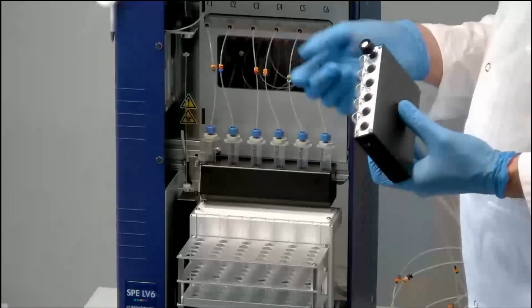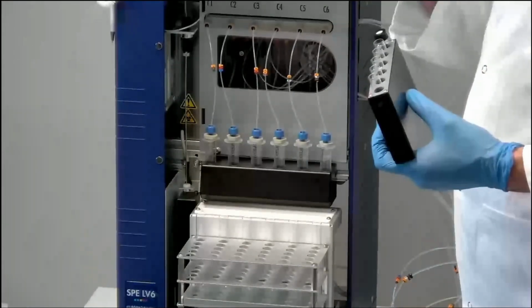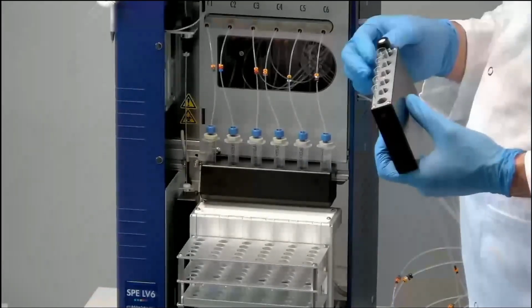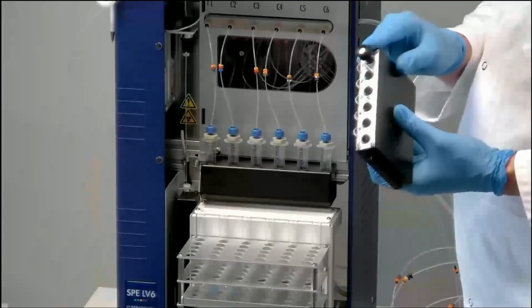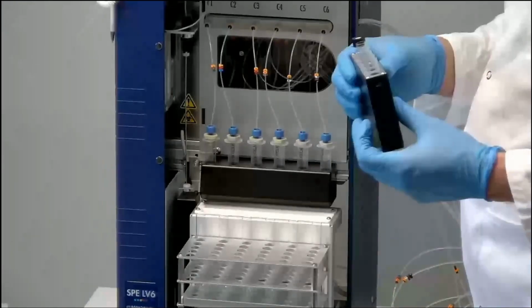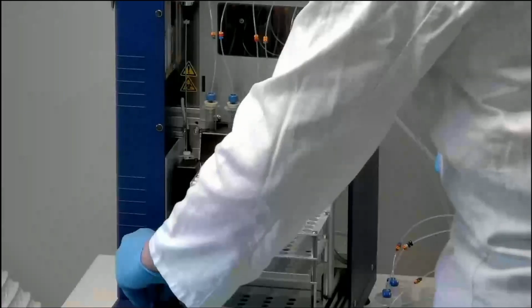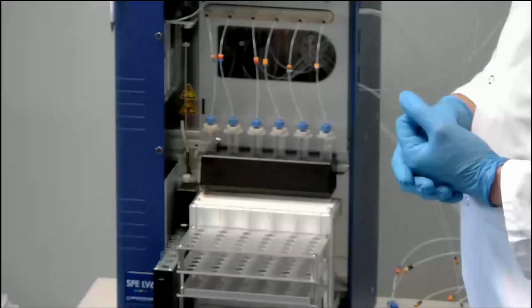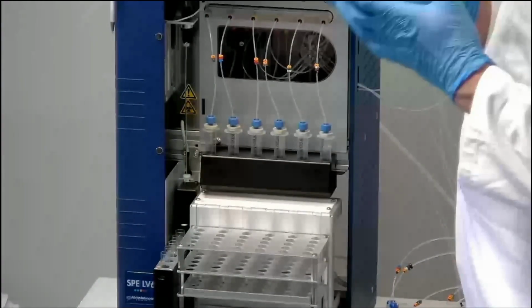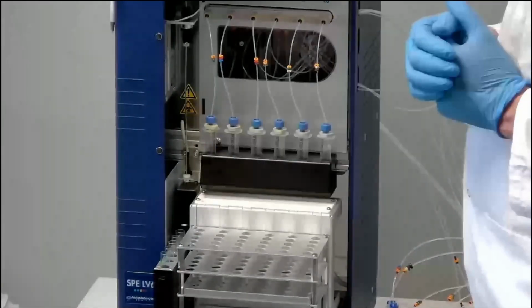That's why, for example, if you want to protect your sample from cross-contamination that you can have with the external product, you can put this screw vial in your autosampler, and you place your rack here, and the nozzle will take your sample inside the tubes.